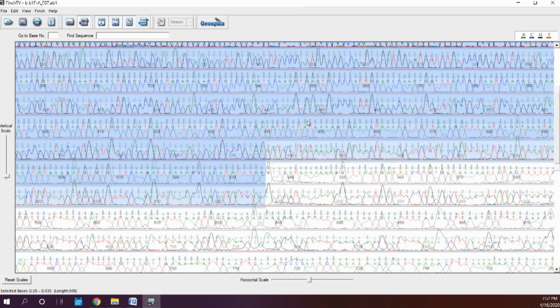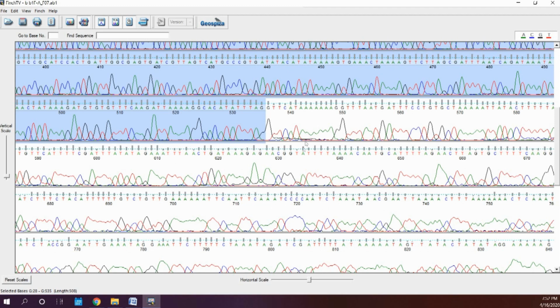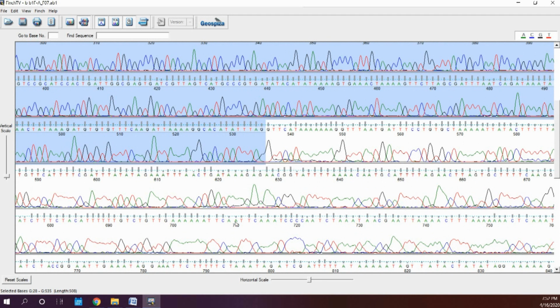Yeah, let's stop here. This long stretch of A's is concerning. Let's see if we can find anything first, and then later on, if we have to, we can start looking through this region.